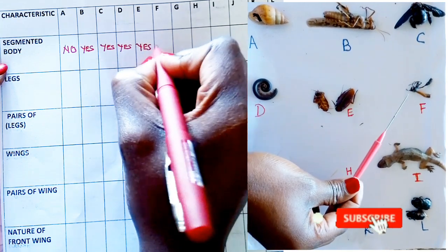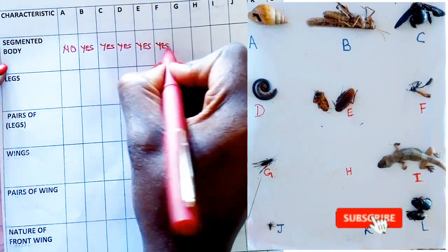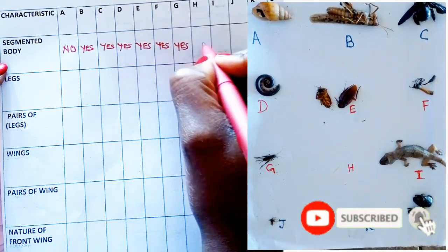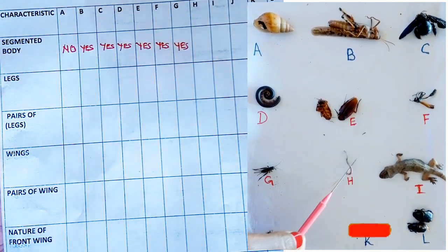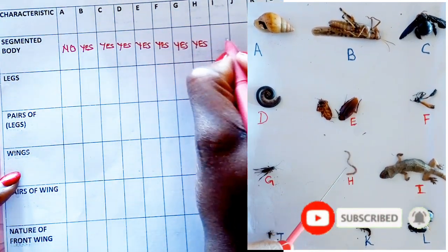Does F have a segmented body? Yes. Nice. G? Yes. H? Yes. You can use a hand lens if it's not very clear, okay? How about I?